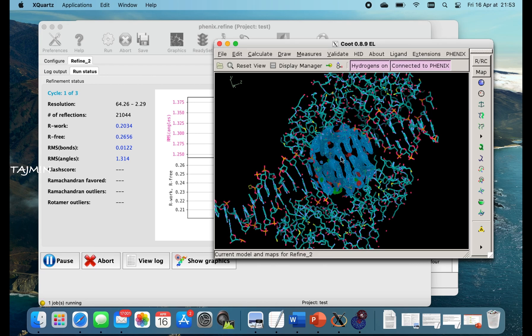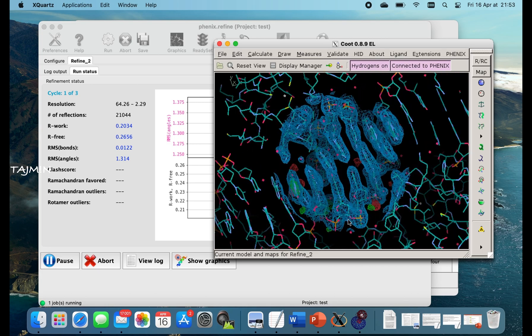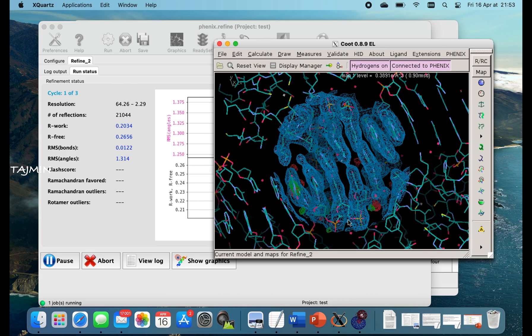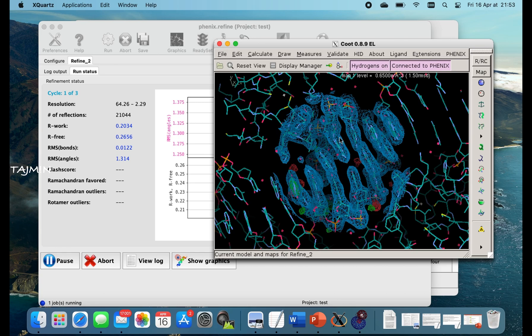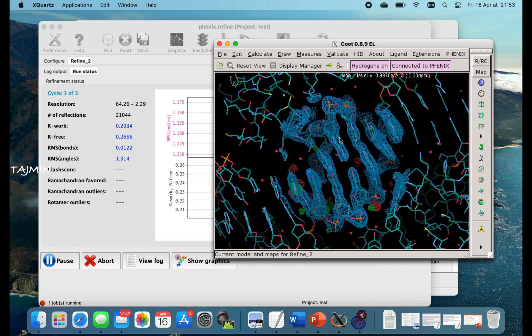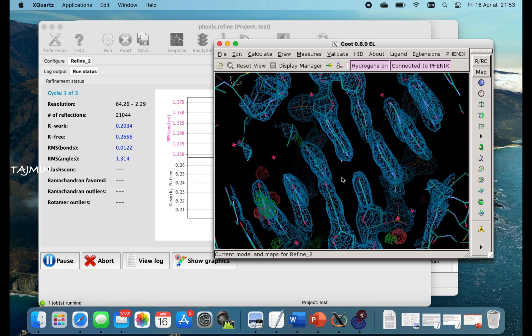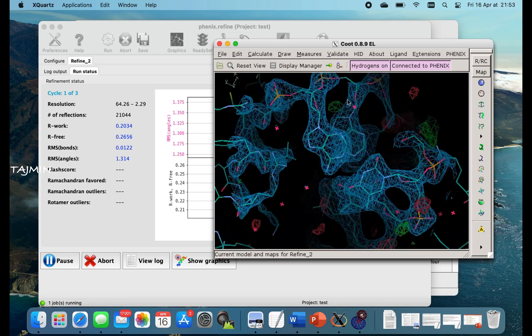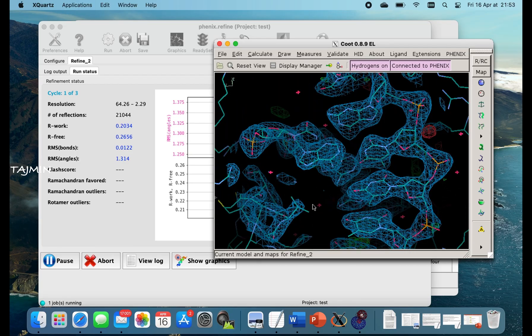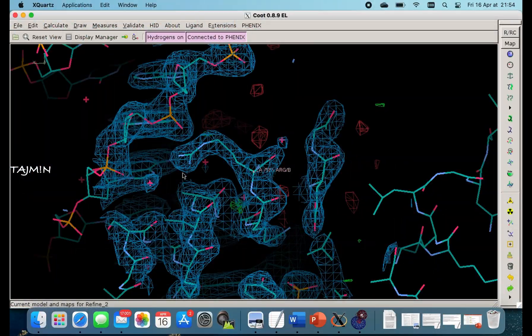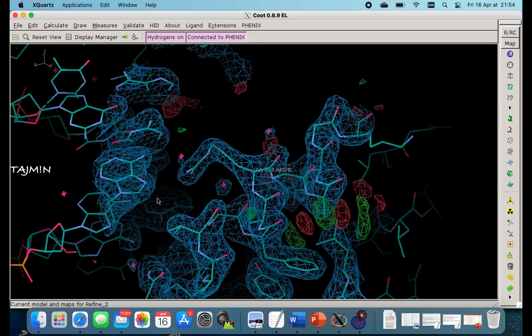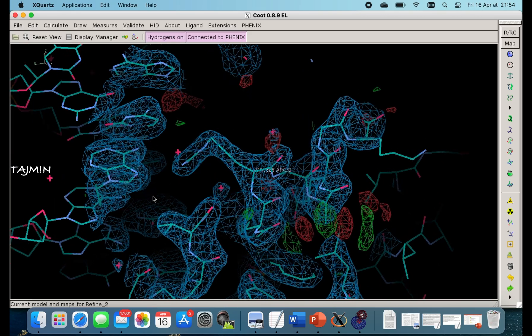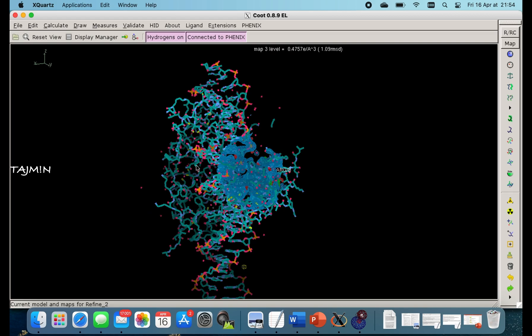You can see how smooth it can rotate. I am using trackpad here which I am not used to. Generally I use mouse. So it's a bit inconvenient for me to rotate smoothly, but the computer is really smooth. Let's notice the electron density here. This structure is at 2.1 angstroms. So you can see a good electron density.